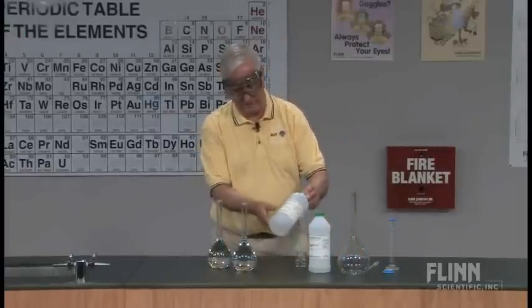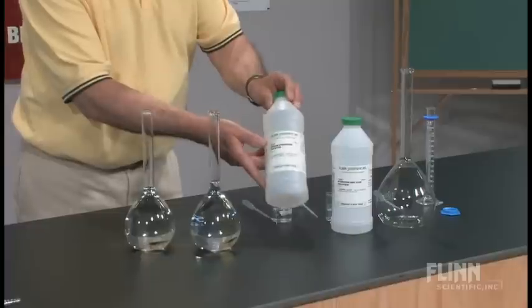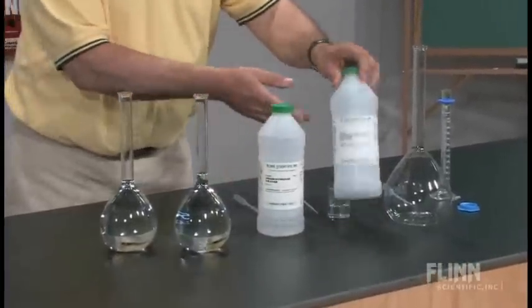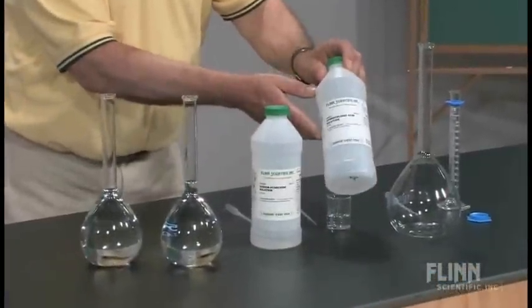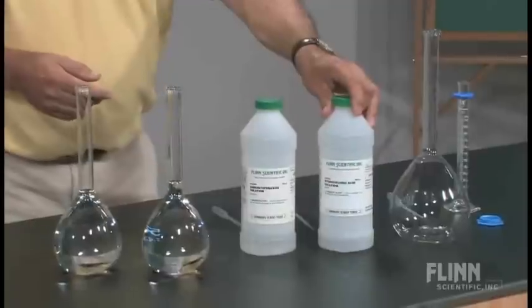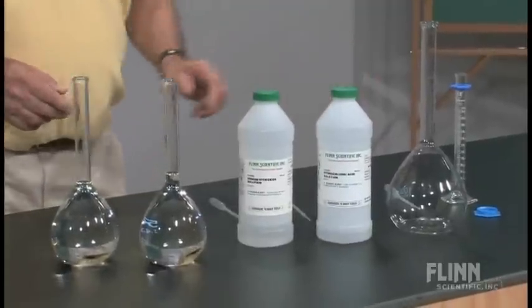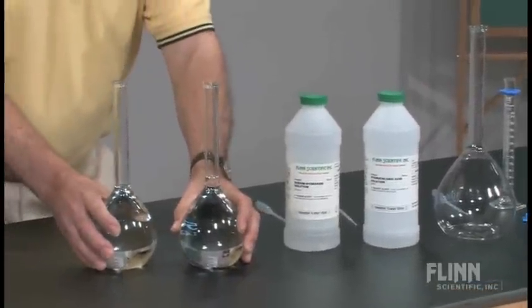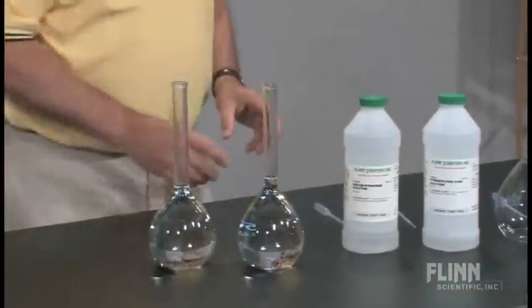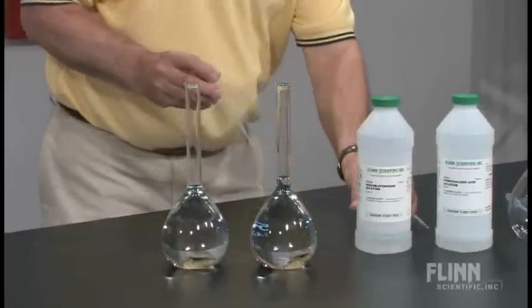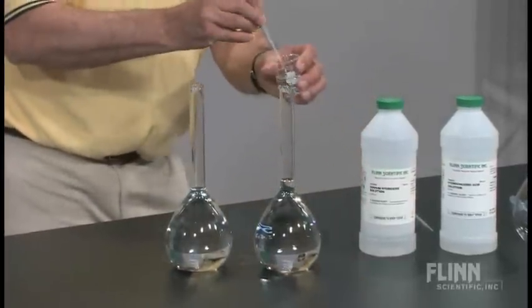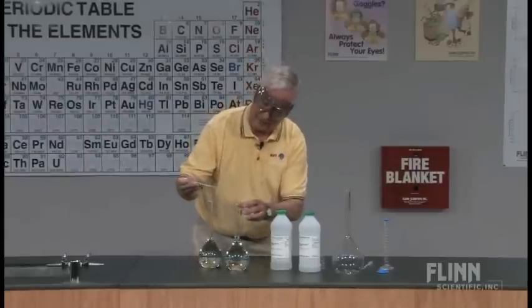I have sodium hydroxide solution, 2 molar, and hydrochloric acid solution, 2 molar, and I have pre-measured quantities. I'm going to bring them up so that I have exactly 500 milliliters of each solution.